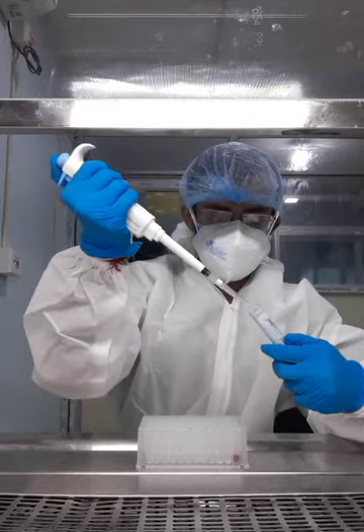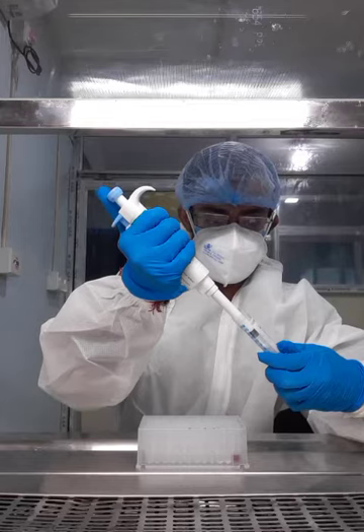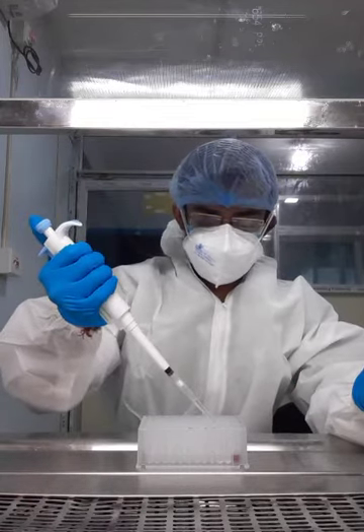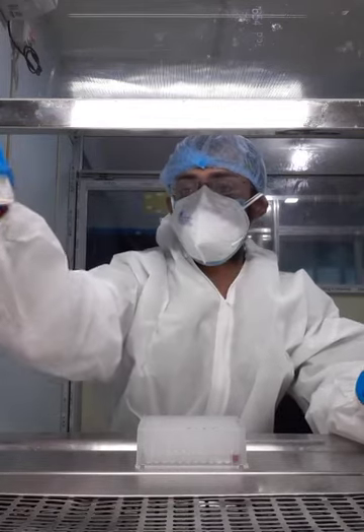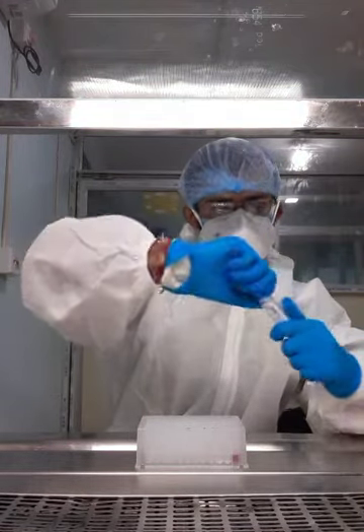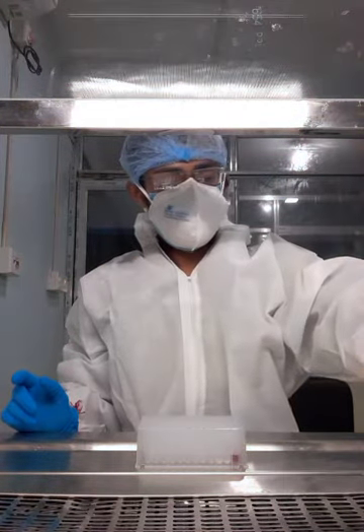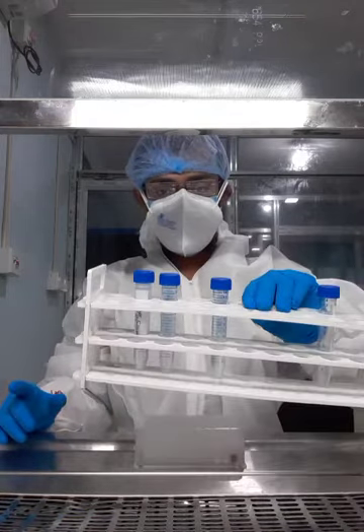Again, I need to take 500 microliter and put it in the third column of patient B. Okay, then I need to dispose the tip. Then I have to cap the 70% ethanol tube and put it in the rack. This is the rack.